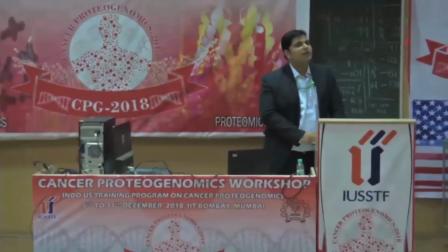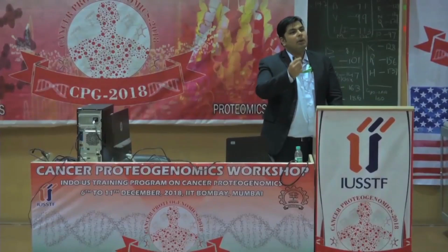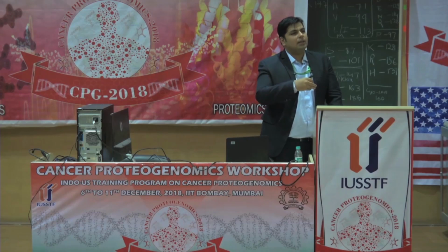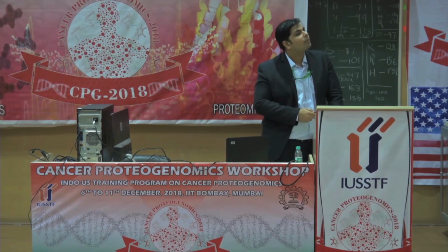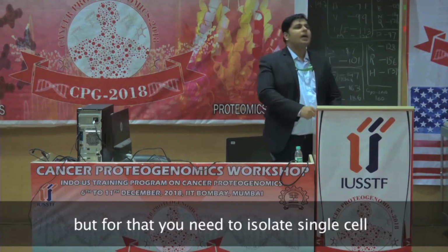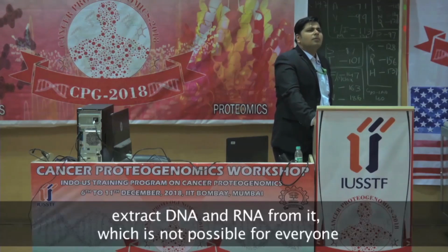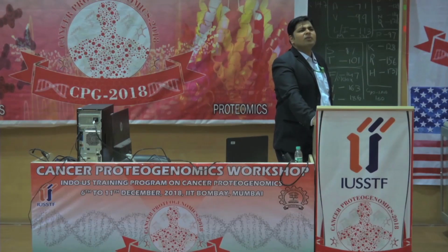It is not for single cell isolation, it is after you have a single cell isolation, because that amount of nucleic acid coming out of the single cell is going to be very minimalistic. So, the system is capable enough sensitivity wise to capture even that minuscule amount of nucleic acid. But for that I need a system that will first isolate a single cell, RNA or DNA from a single cell and put it for a PCR. Yes. Which may not be quite possible in all likelihood. It's not very difficult, ma'am. You can do a single cell isolation by flow cytometer very easily.